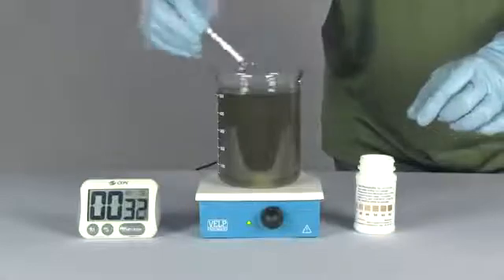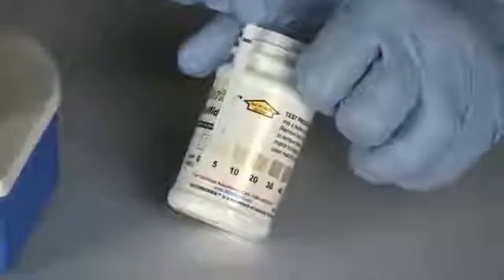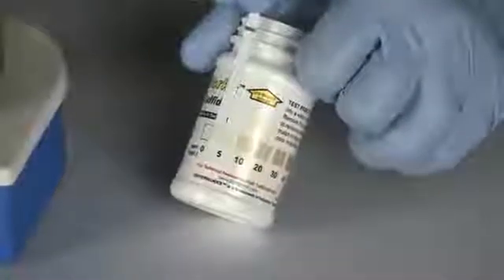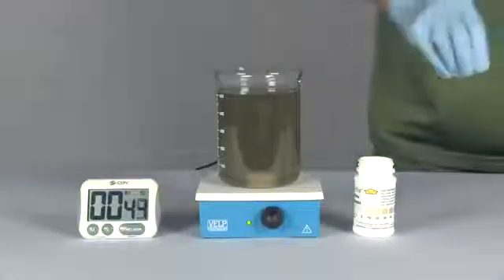At 30 seconds, another reading is taken and the hydrogen sulfide level is measured. The reading is zero parts per million. The Ultra S3 has removed all of the sulfide in less than 30 seconds.